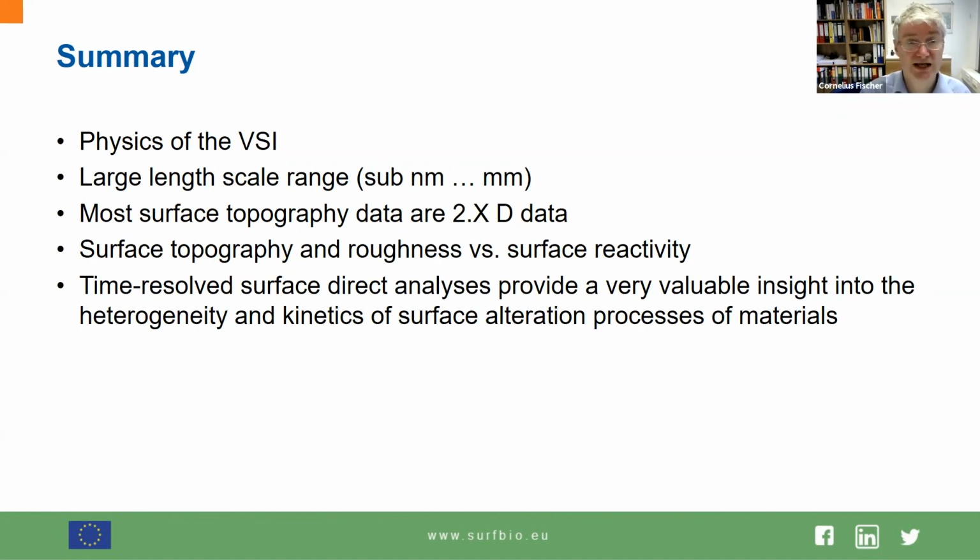It's XYZ data, very specific. And you should keep in mind what to do with these sequences of surface data sets by analyzing them using time-resolved data sets, or just having some information about topography, and then you try to introduce some statistical analysis by doing surface roughness calculations.